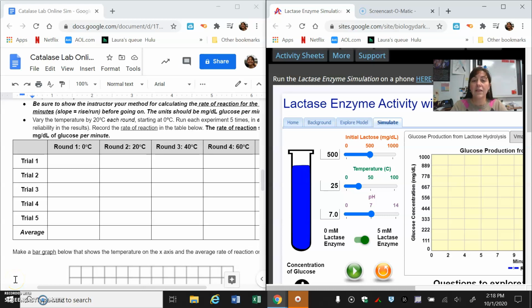Hi, Living Environment kids. I thought today I would show you how to do the Catalase online lab. It can be a little tricky as we're trying to maneuver a couple of things, so I thought it would be a good thing to make a quick video.